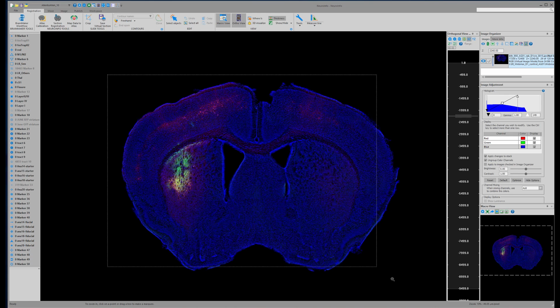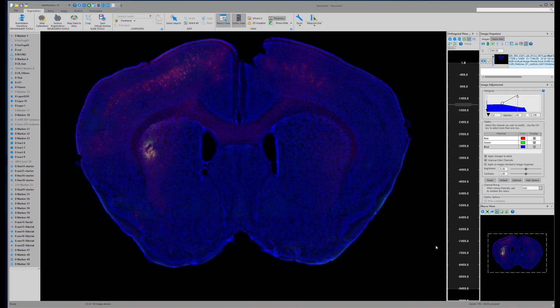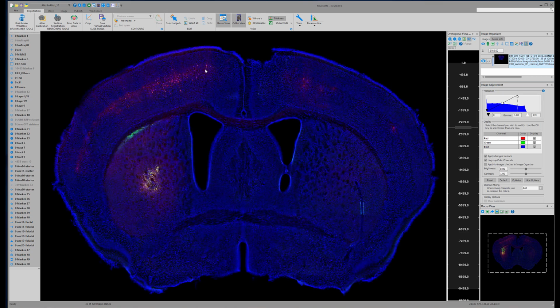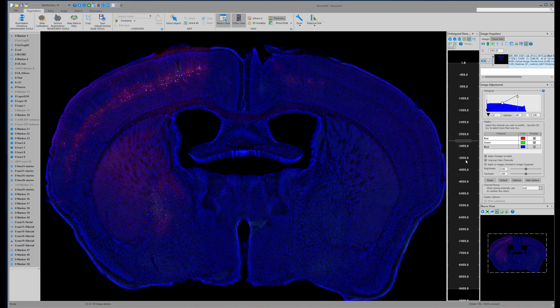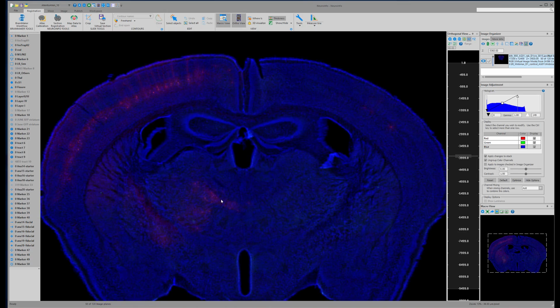Enlarge. So this is a brain that's had an injection of rabies into the striatum, and it's transsynaptically labeling neurons in the cortex that projected to those D1 neurons in the striatum, and we march through this brain. And you can see through the orthogonal view the section that it's at. There are neurons in the globus pallidus, neurons back in the thalamus. They're also labeled.